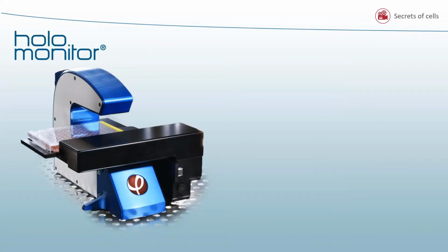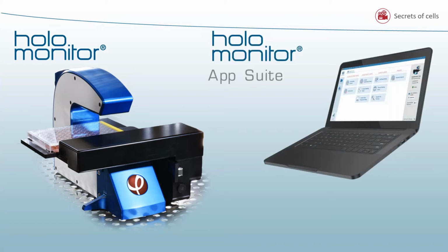So as I mentioned a couple of minutes ago, today I'm going to be talking about label-free applications for live cell imaging. HoloMonitor comes together with AppSuite software, which is designed to help you in your research, and it has three types of applications. First of all is guided endpoint, which lets you obtain information on one selected time point. Guided kinetic applications let you obtain information about your cell populations in time. And in-depth assays, as the name implies, let you get to know your cells better, studying not only their populations, but also individual cells. Now I will quickly introduce you to all the applications separately.